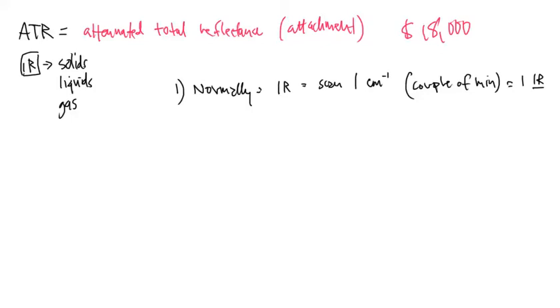If you want to run another one, just to kind of double check yourself to make sure that that is the proper infrared, then you're going to have to wait another couple of minutes. If you want to do a third analysis, again to double check yourself to make sure everything stays consistent, it's going to be another couple of minutes. And this is just really the process of running. This does not include the process of loading a sample up.